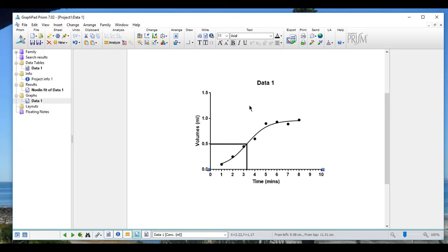You will note that there is a place here to add a graph title. Titles are not placed above the graph itself in written work like papers and practicals. The titles of the graph become part of the figure legend. They are only used for posters and projects and projected images where people may have a harder time reading small print. A larger font is very helpful, so don't add titles onto the graph itself. This is deleted.